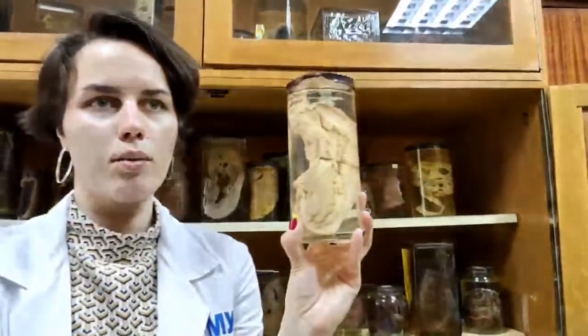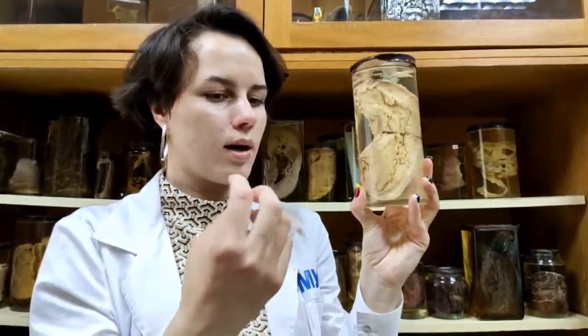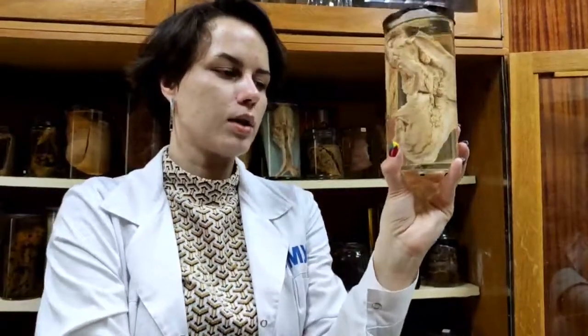And this is a very special type of gastric adenocarcinoma, which we call signet ring type adenocarcinoma, because cells remind of signet rings. Signet rings is something like, I don't know, like this, signet ring type adenocarcinoma. They are non-cohesive. I mean that these cells don't build any glands, and this is a very dangerous type of cancer. In this type of cancer, usually surgeons remove all the stomach at the beginning, because it's spreading really fast.